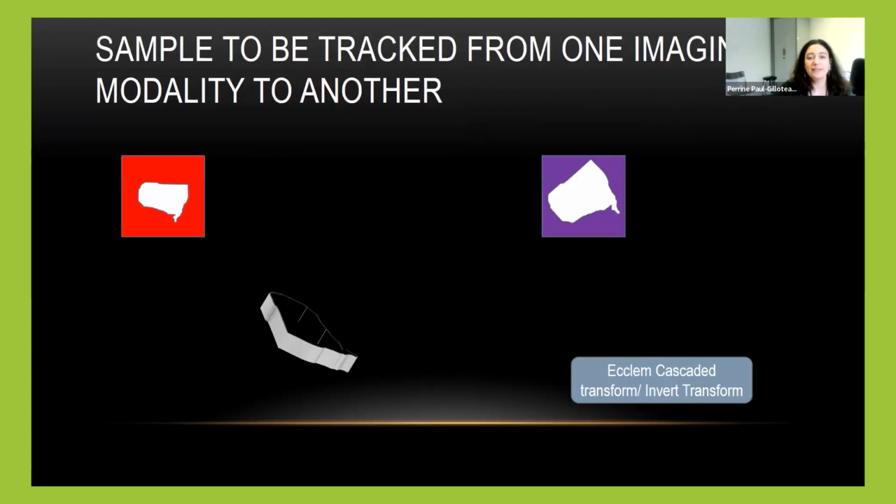So the first thing which can be useful when constructing a correlative microscopy workflow is that most of the time you have two modalities that maybe you really want to merge at the end, coming from a 3D sample, and the images can be 2D or 3D.